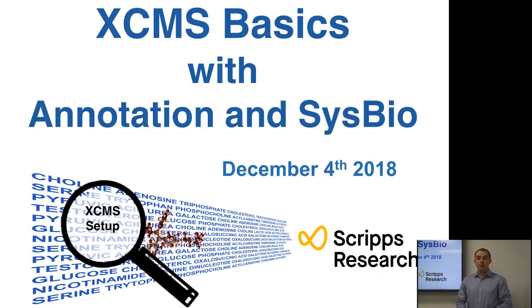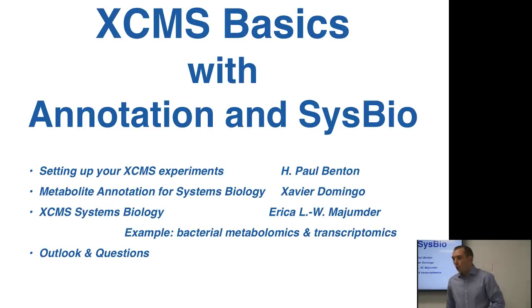And we have three different speakers who are going to be talking for you today. First off is going to be myself. I'm going to be speaking about setting up the XCMS experiments and using XCMS online.